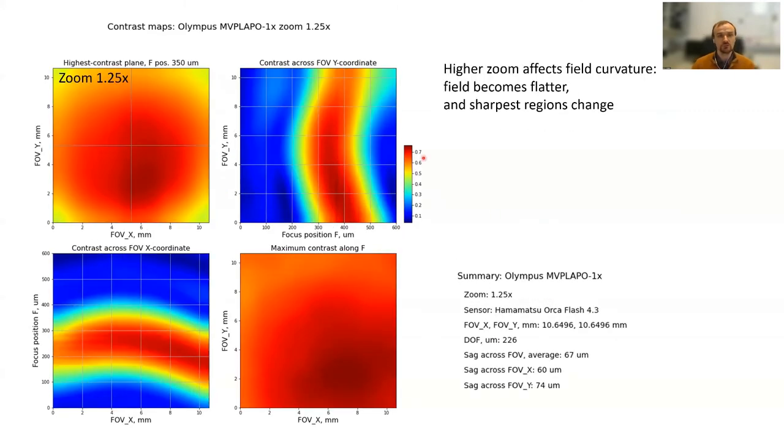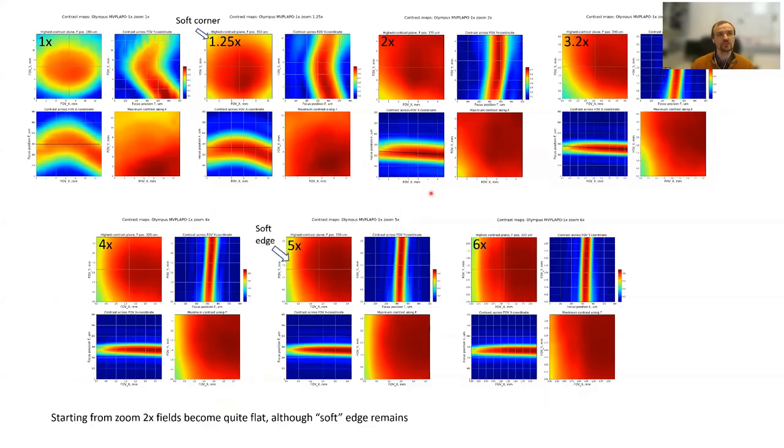You can repeat it for different zooms and compare the zoom settings. This is a comparison table. You can see when you increase the zoom, the field of view becomes flatter. This is 1.25x and this is 3.2x. It is flattest at 6x.